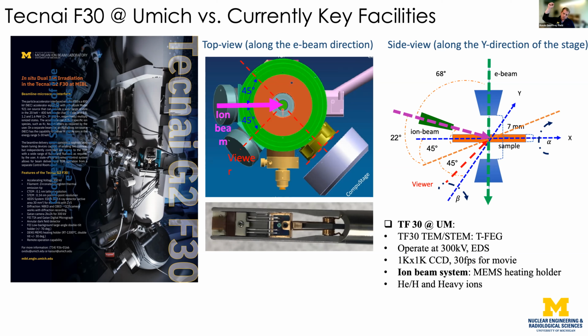But this is also then our configuration. So if you look down through, like if you're an electron basically going down, you would have your ion beam coming in from the left. Your CompuStage stage 2 goniometer would be down here.